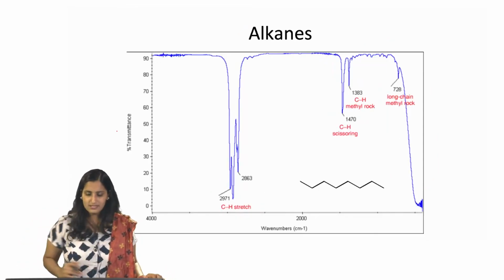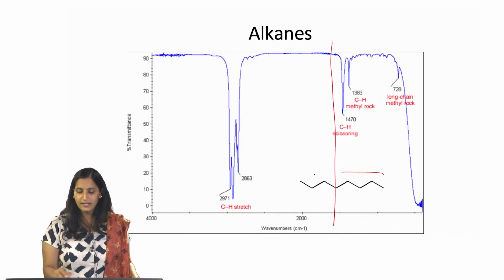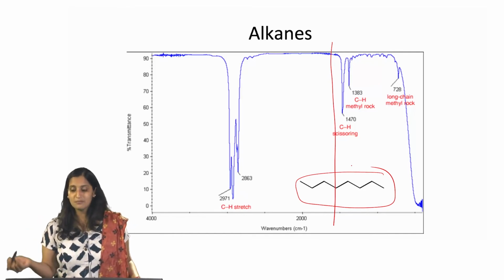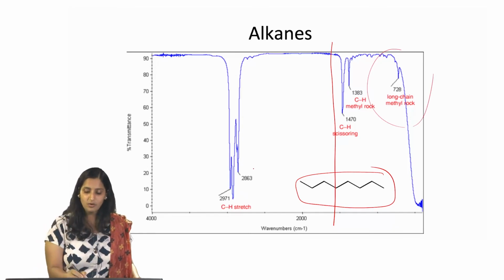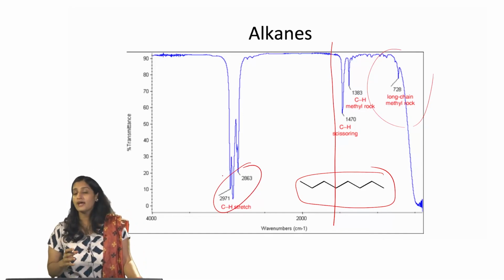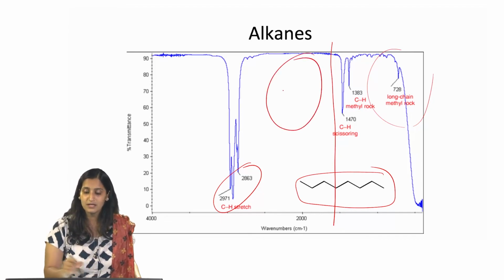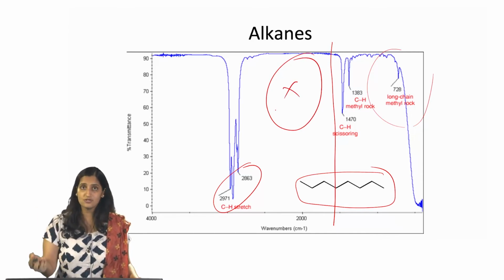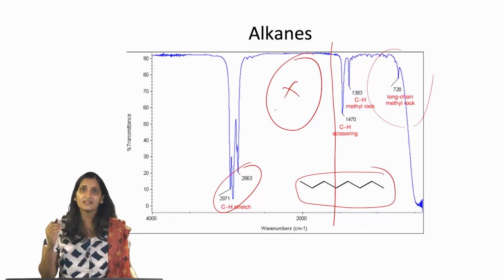Okay. So, alkanes are a very simple kind of IR. Again, let us not look below 1500, but in an alkane you pretty much have carbon-carbon and carbon-hydrogen bonds. Now, CC bonds we know are somewhere below 1500, but CH bonds, all of them will show up around 3000. So, that is how I know that I do not have a carbon-carbon double bond, for example, because if I had one, I would see a peak here. Since it is missing, it does not have a carbon-carbon double bond, carbon-oxygen double bond, or carbon-nitrogen double bond. So, IR tells us about the functional groups present in the molecule.